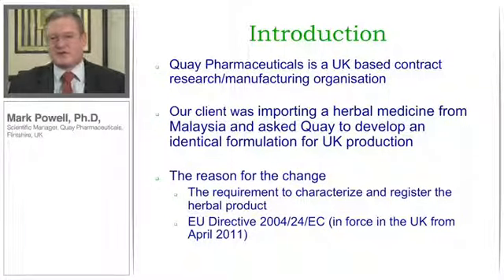The reason that they asked us to do this was a change in the legislation. In 2011, the European Herbal Medicines Directive was introduced to the UK, which requires all herbal medicines to be registered. And to do that, of course, you need to characterise them.